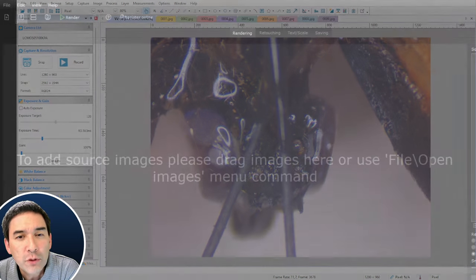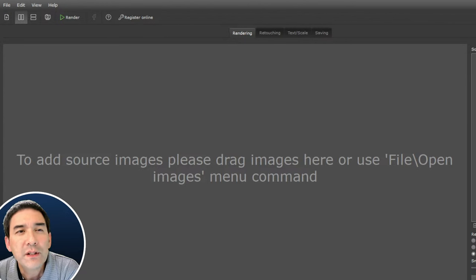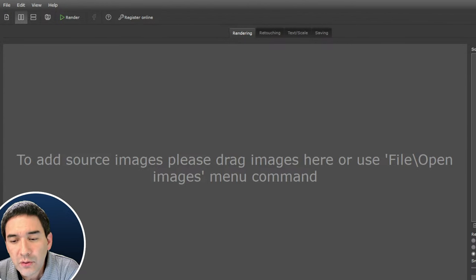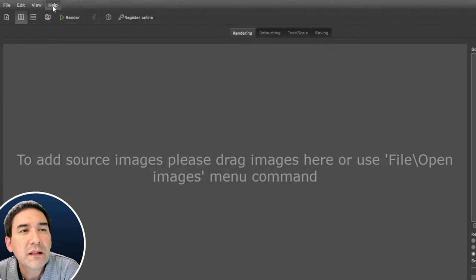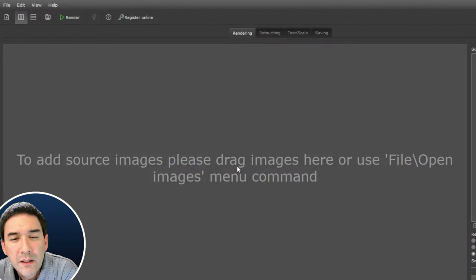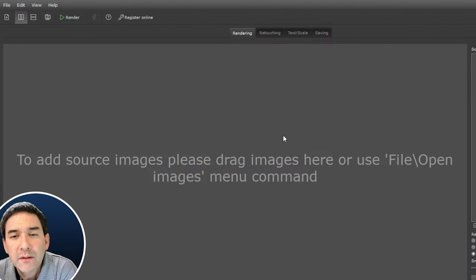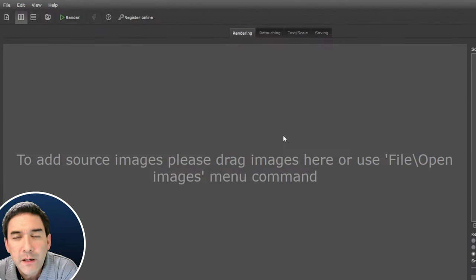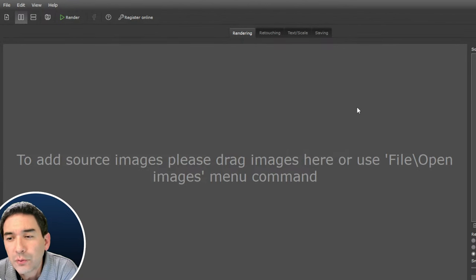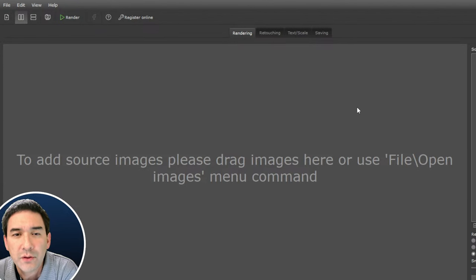Helicon Focus is a commercial program — heliconsoft.com. You can download it and get a 30-day trial version. Otherwise you have to pay for it. The good thing about this program is it's extremely easy to use, very fast, and produces quite good results. I go to File > Open Images, select the images, and here they are on the side.